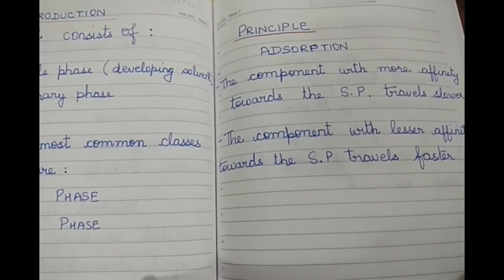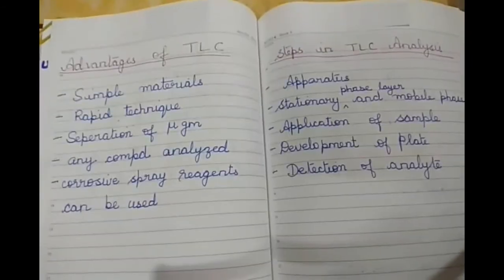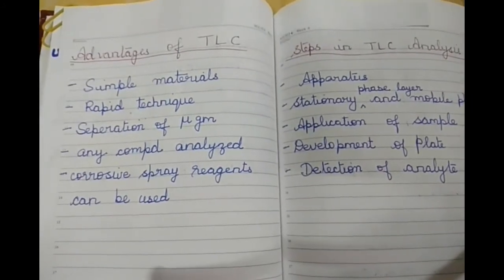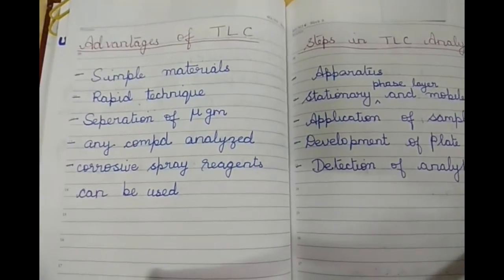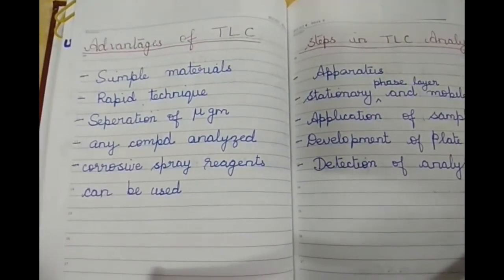Advantages of TLC. This method involves simple material and cost of the equipment is low.